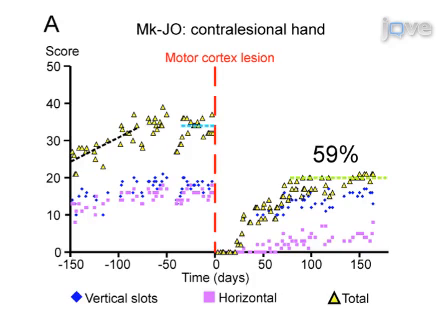quantitative analysis. The main advantage of this technique over existing methods, such as clinical scoring, which is, by the way, subject to large inter-rater variability, is that it is truly quantitative and reliable, with moderate inter-individual variability. This method can help answer key questions in the behavioral neuroscience field, such as mechanisms underlying plastic reorganization of the central nervous system following a lesion or a neurodegenerative disease.